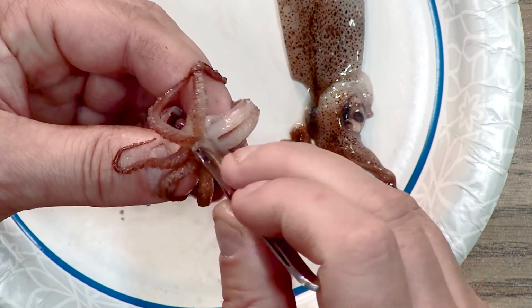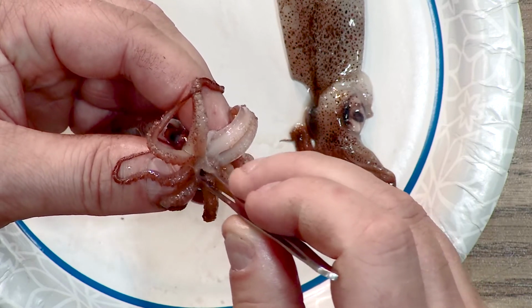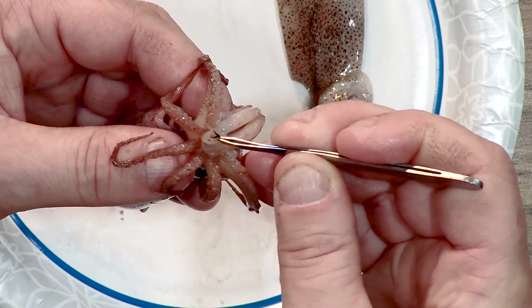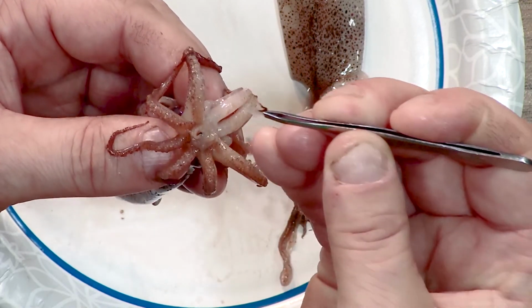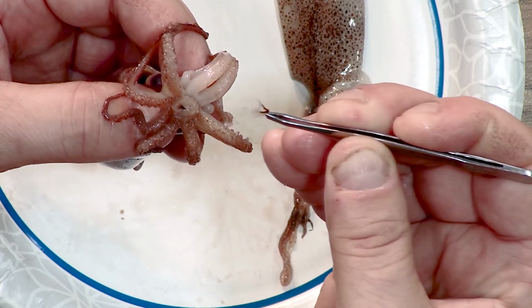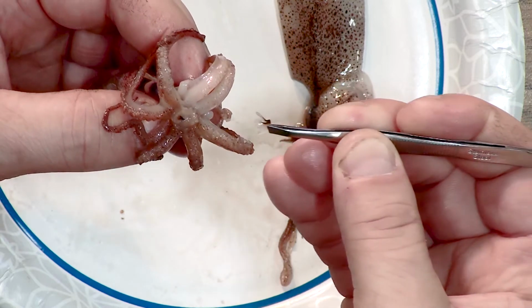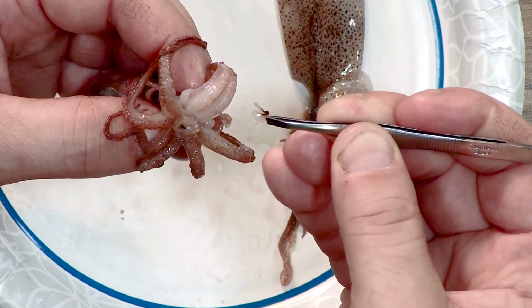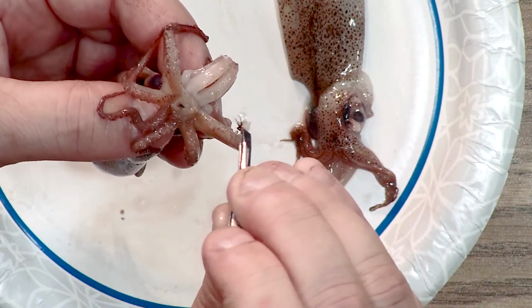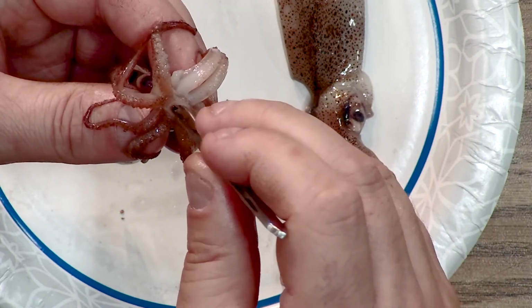And I'm going to squeeze this area a little so it protrudes. And I'm going to use my tweezers to open up the mouth here and see if I can grab hold of that beak. Okay, I've got it. And I've pulled it out. Oh, this is great. You can see that really good. See the dark V shape? That is the part of the beak that comes to a point. And then there's a clear cartilage part that connects it. Now, as I said, this comes together, and right now I only have half of it. So I've got to get the other half out.